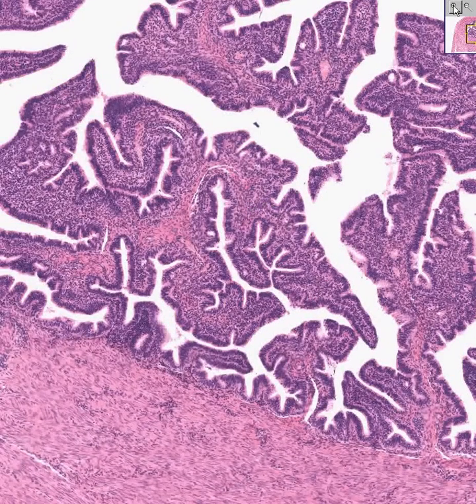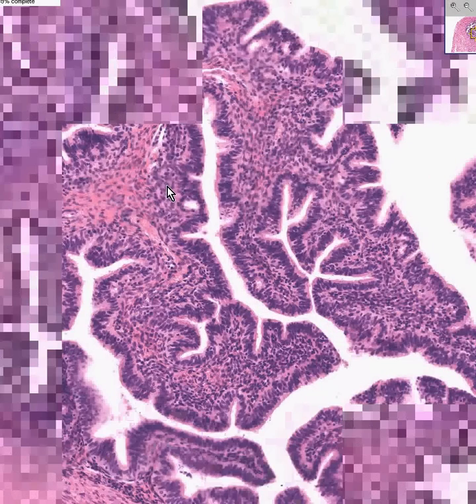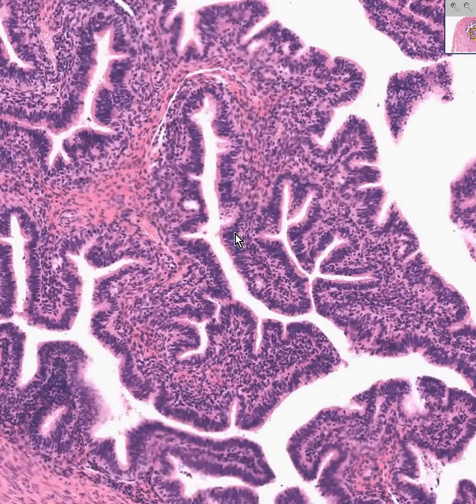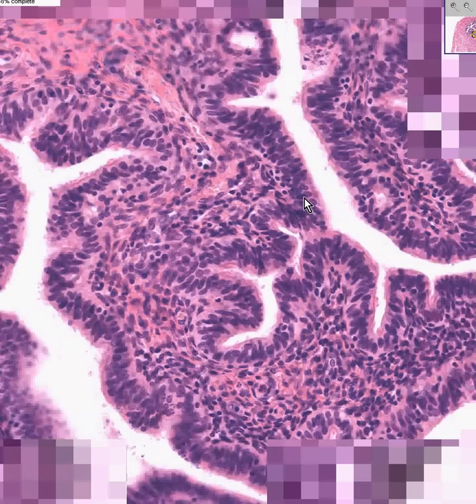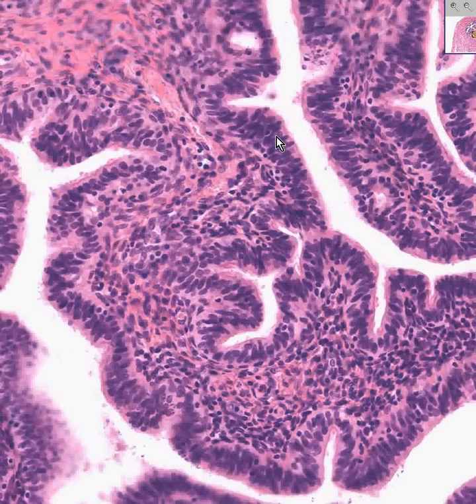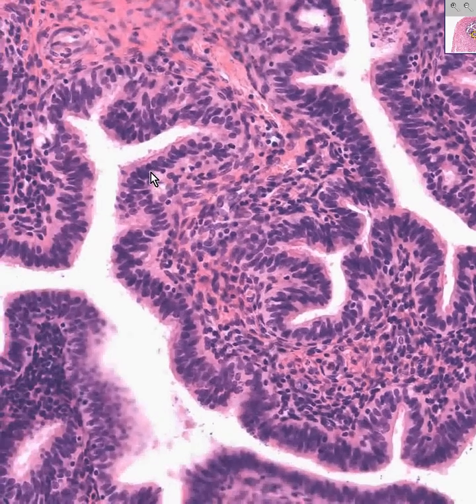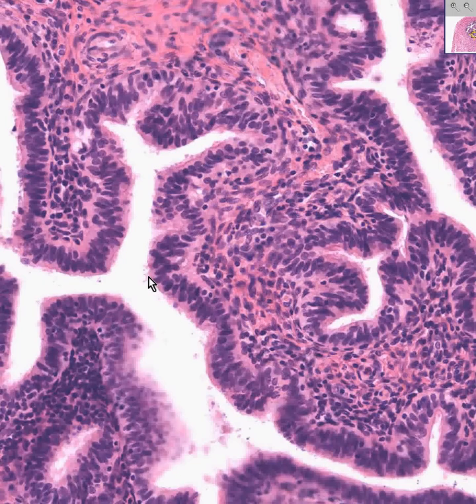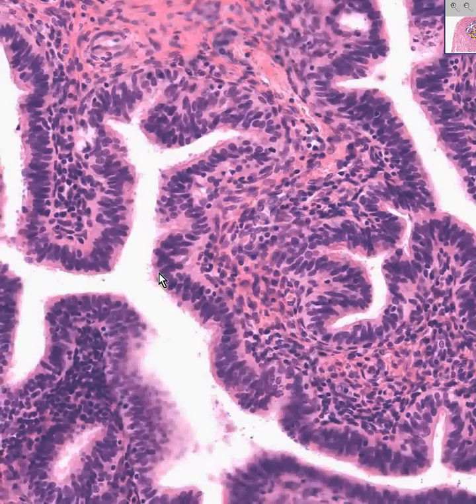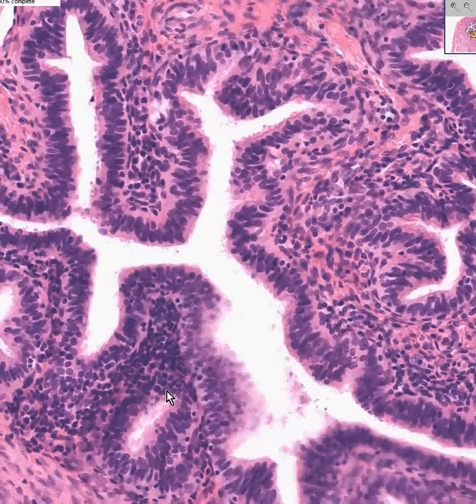Like the rest of the Mullerian duct structures, it is a columnar epithelium, supported by fibroblasts and a little bit of smooth muscle as well. It is non-stratified. Even though the fallopian tube has four different areas, the epithelium of the mucosa looks a lot like this. And do you see some cilia here? That may be because it wants to transport things like sperm.